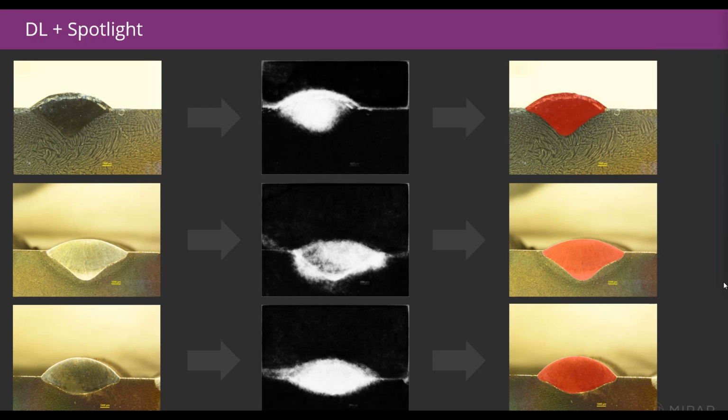And then you take all of those slices and you need to align the features to themselves. You need to segment the features out from each slice, and then you need to stack everything back up and create your 3D microstructure reconstruction. That is all supported by our 3D toolbox that allows those serial section data sets to be processed in that manner.